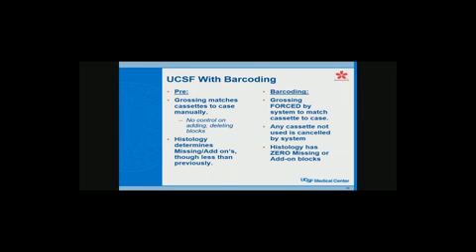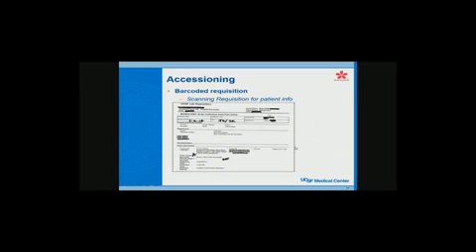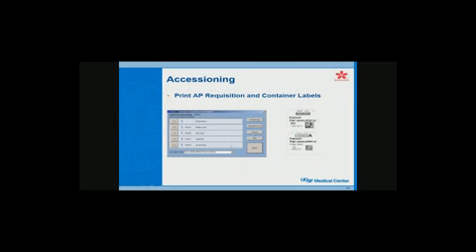So this is something, it wasn't totally barcoding that did this, but having the cassette printer linked up and forcing them to put the cassette in racks that helped out histology. So there's a lot of components to this, but this definitely helped out when barcoding came in, a lot, because we didn't have to sort things out by that time. In other words, this process took about 3 years to get through all this, but by the time barcoding started, we had grossing in good shape, and so we didn't have to deal with that on top of barcoding.